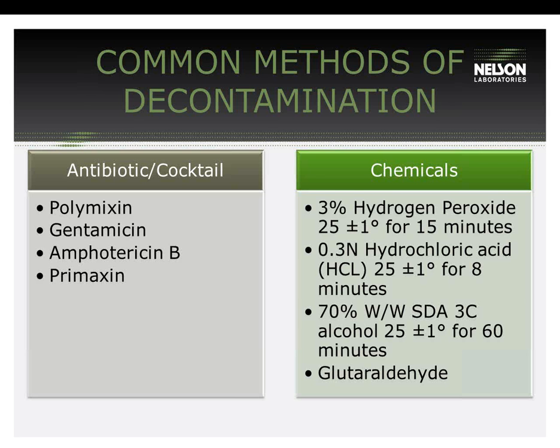Once the devices are contaminated, the samples go through an antibiotic or a chemical soak, which is the most common method used in the reprocessing for tissue validations here. As you can see, here's a list of antibiotic chemicals that have been used for the process validations.